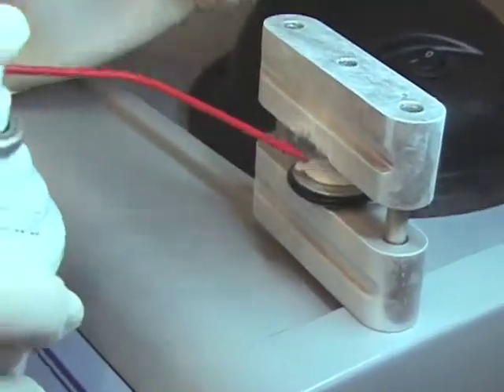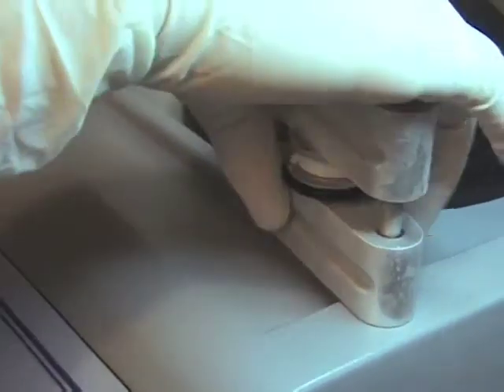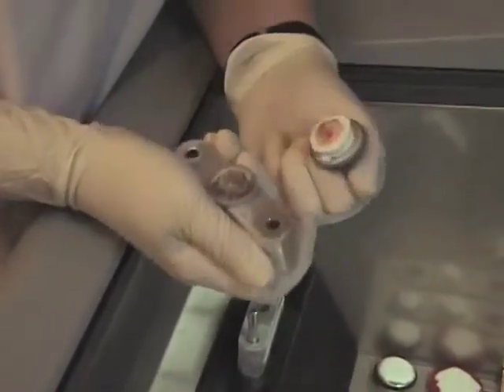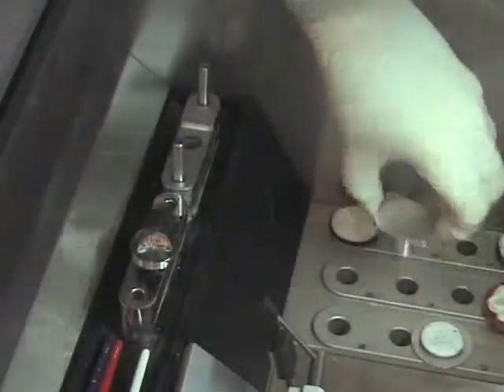The smooth disc is easily removed from the cutting chucks without the need to partially thaw or twist. They will never break or cut the technician, which can happen with glass slides.